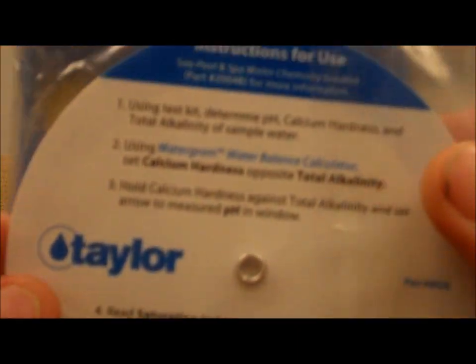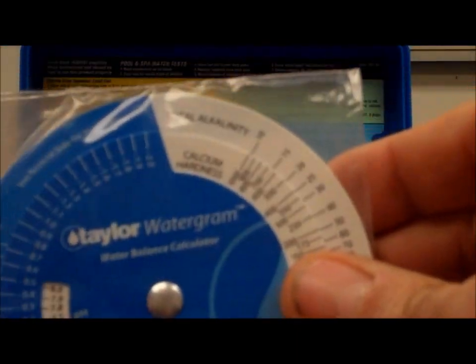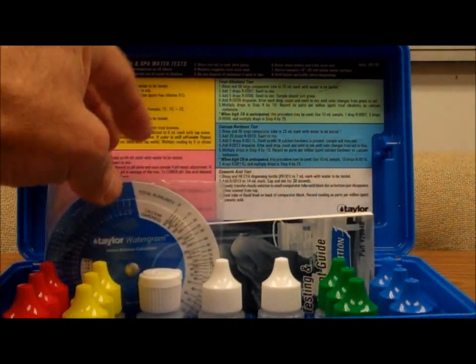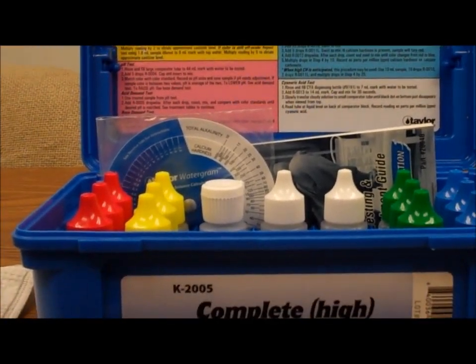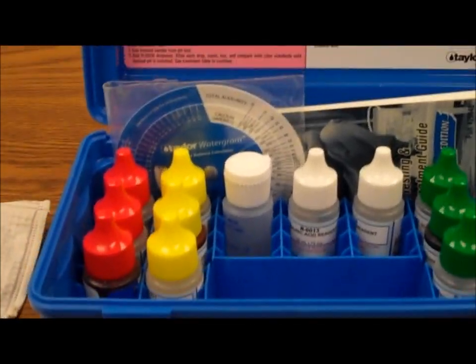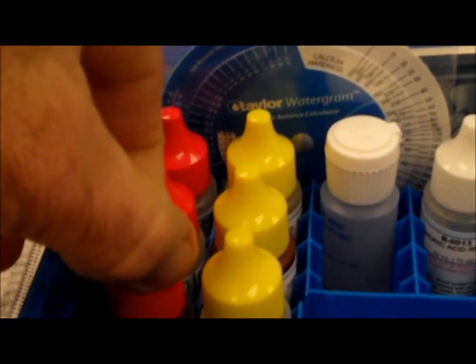It can tell you when you're in balance and what adjustments you need to make to achieve balance with your pool water. Finally in the box we have all of the reagents, and they're color-coded. Red bottles are the tests for pH.